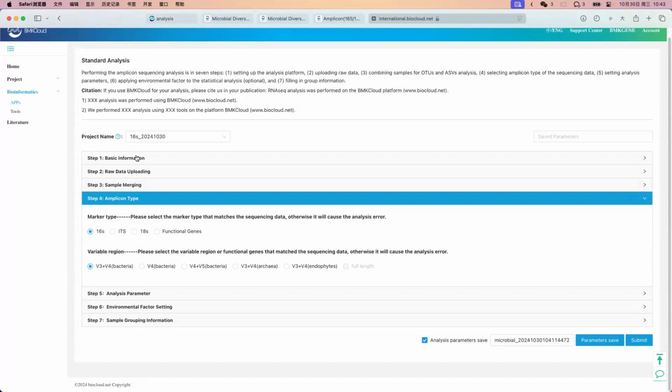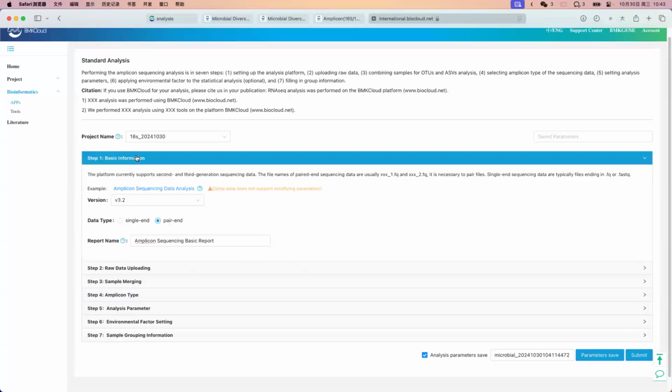your situation. But what if someone doesn't have the specific data and wants to try our BMKCloud Amplicon? What should they do? We prepared an example data, or you can call this demo data, for Amplicon. You can just click here.